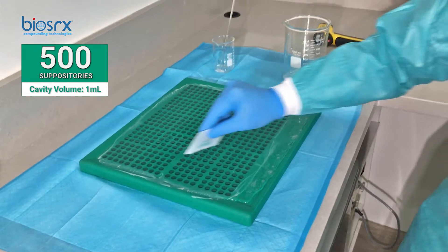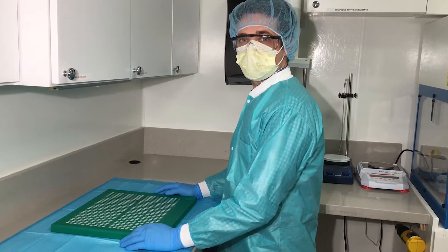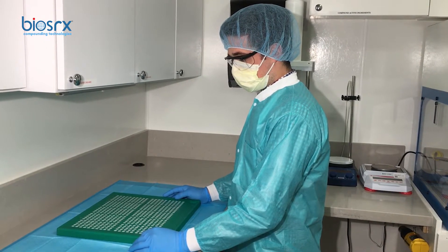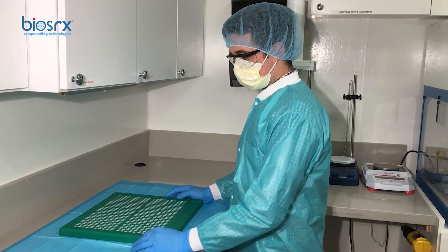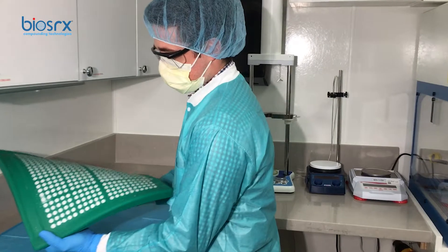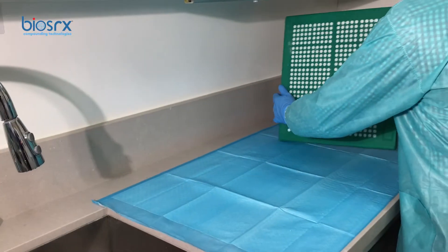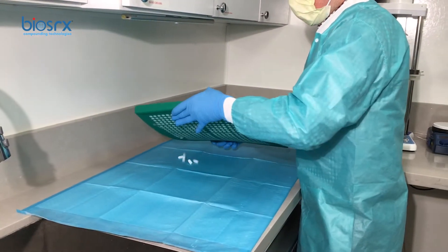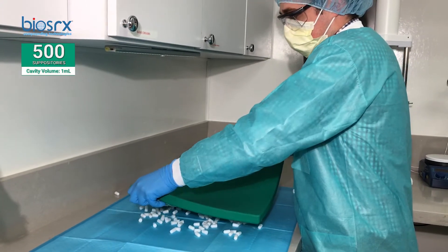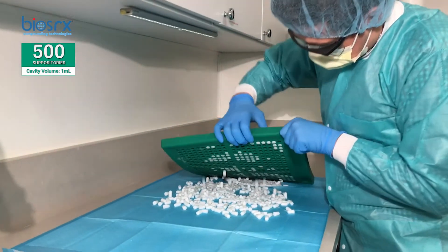Today we're going to show you how to remove the suppositories from the Pebble Beach suppository mold. This is a high-density silicone mold with 500 cavities; each cavity holds a 1 ml volume. Today we have Alex. First, we're going to start bending outward to loosen up the suppositories — just rotate the mold to try to get all the suppositories loose. The mold is semi-flexible. Next, we're going to flip it over, and as you can see there's minimal effort taking place — the suppositories are practically just falling out of the mold.